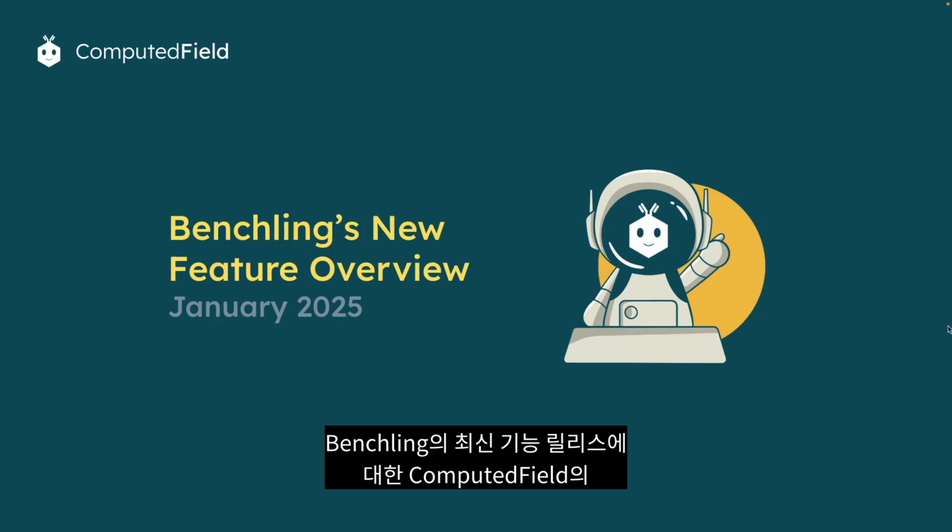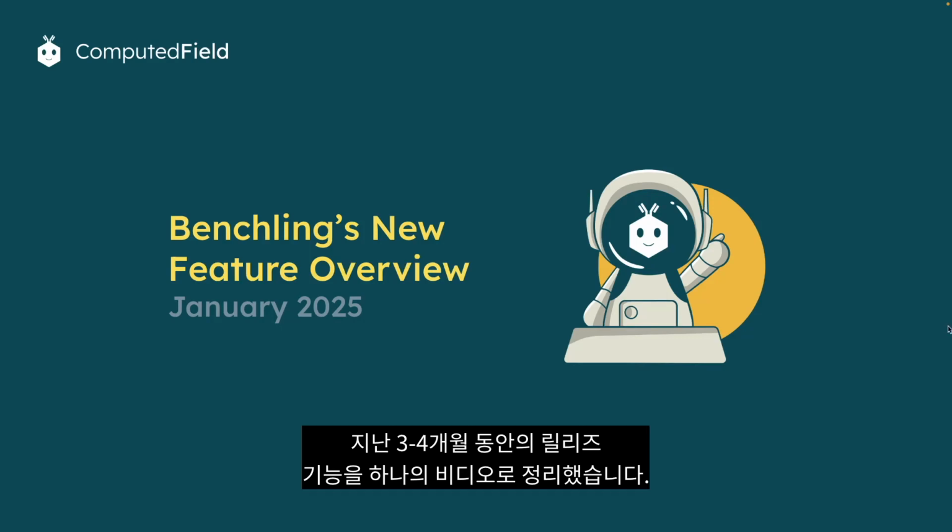Welcome to ComputedField's overview of Benchling's latest feature releases. We've taken the feature releases from the last 3 or 4 months and collated them into one video.